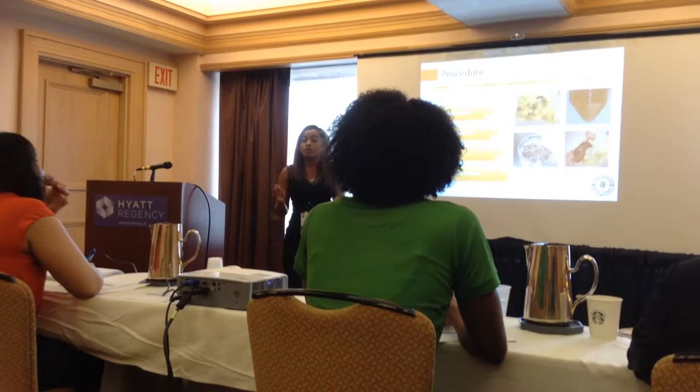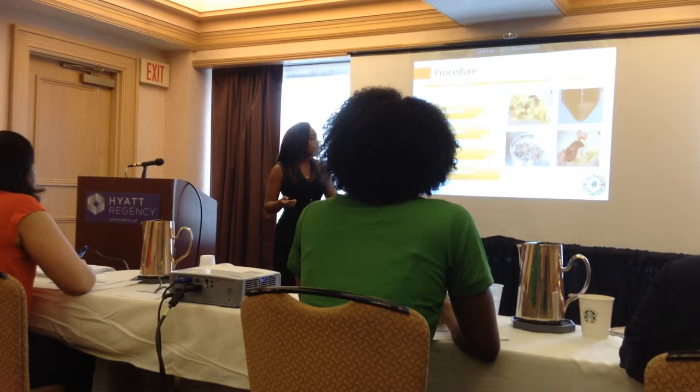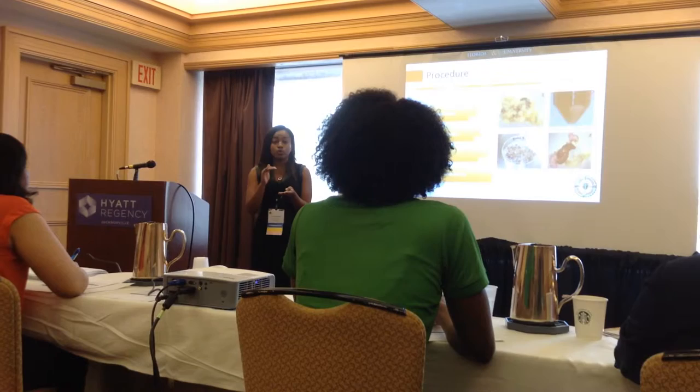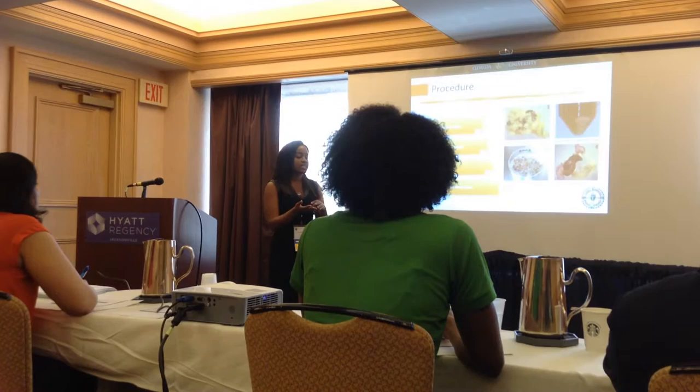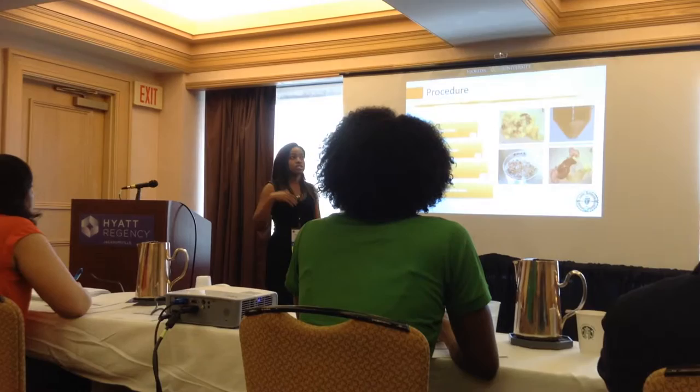It's a 72-hour process consisting of about 15 different steps. Once I co-cultivated my agrobacterium with my cell culture, I went ahead and suppressed the microbial growth of my agrobacterium by putting it on a selective media that contained an antibiotic that this agrobacterium was not resistant to. So it was resistant to things like rifampicin, kanamycin, and tetracycline. However, it was not resistant to cefotaxime. And so that's the antibiotic that we decided to use.